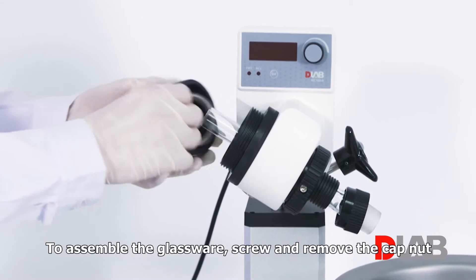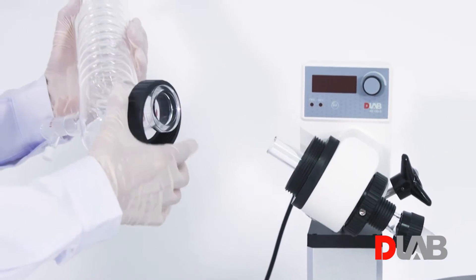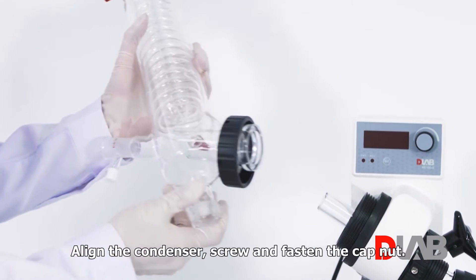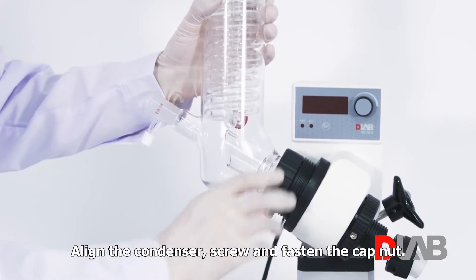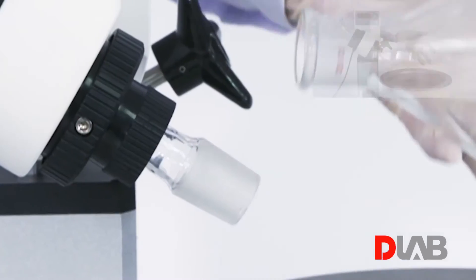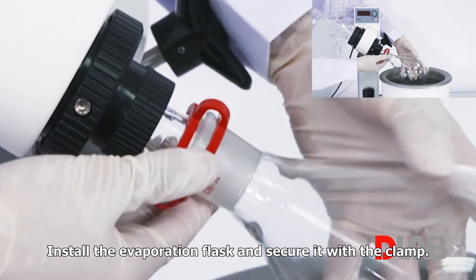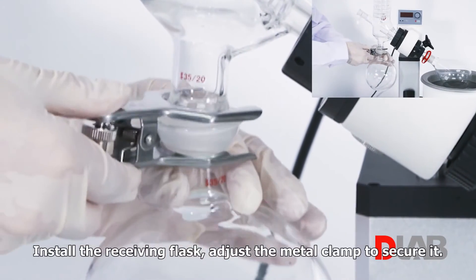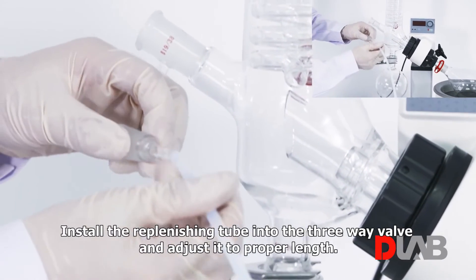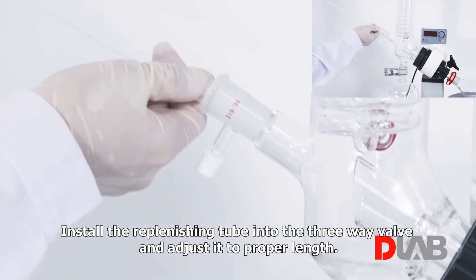To assemble the glassware, screw off and remove the cap nut and the locking spring. Put them on the condenser. Align the condenser, then screw and fasten the cap nut. Install the evaporation flask and secure it with the clamp. Install the receiving flask and adjust the metal clamp to secure it. Install the replenishing tube into the three-way valve and adjust it to the proper length.